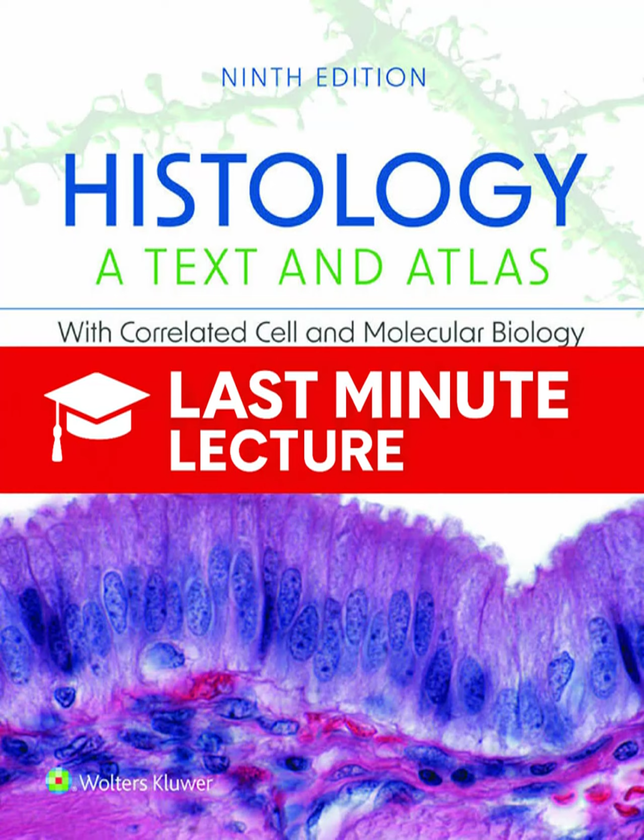Second is gelation, where the monomers polymerize into a dense, cross-linked hydrophilic 3D matrix that is now physically attached to everything inside the cell. And then you have to get rid of the original cell structure. Yes. The third step is mechanical homogenization. You break open the cells and use enzymes, proteases, to digest all the structural molecules. This is key because it ensures that the only thing holding all the labeled components in their relative positions is that artificial hydrogel matrix. And then comes the magic.